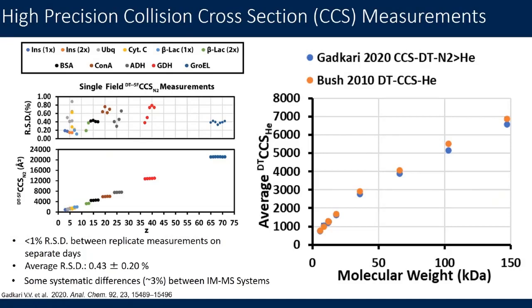This is not something that you would typically see for small ions, but since proteins are so flexible and dynamic, these types of changes can be important to consider when one thinks about databasing these types of values and using them from the point of view of structure determination, or in the context of simply identifying protein isoforms associated with these different classes of protein.